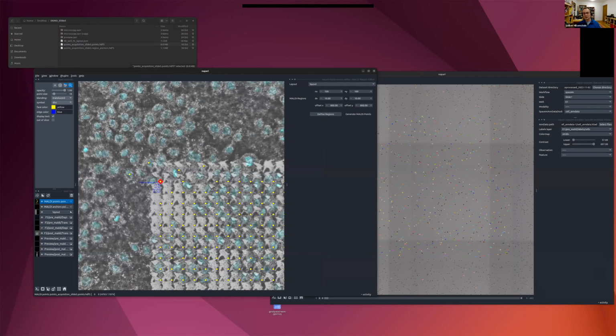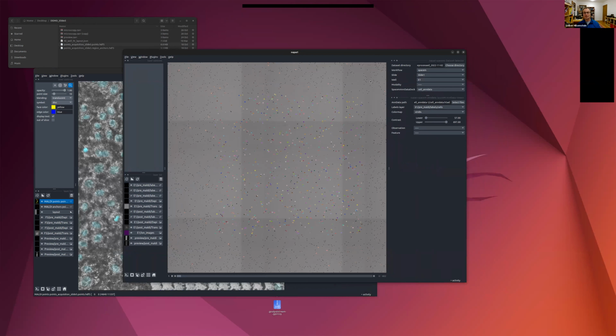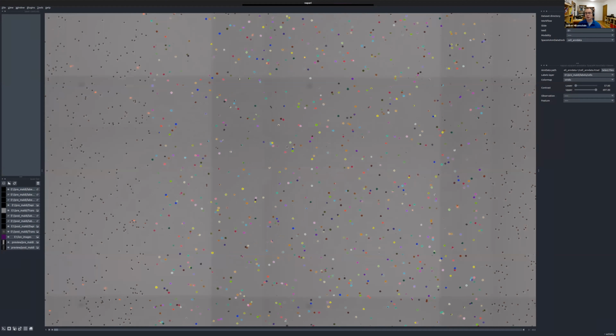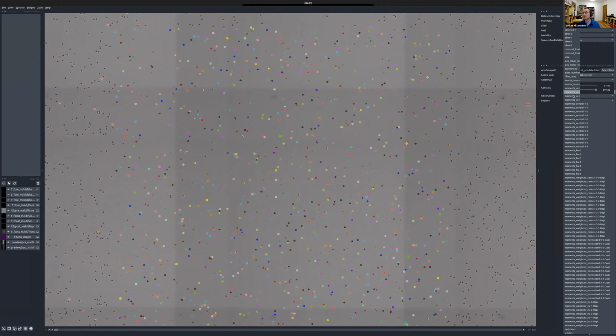The other thing I mentioned is Andreas's results visualization. So some of the results that we have are of course segmentation images. So you can use the labels layer in Napari. So here you see segmentations, but then if you go back to the beginning, we had these things where you calculate morphological properties. So you might actually want to see what is the cell area.